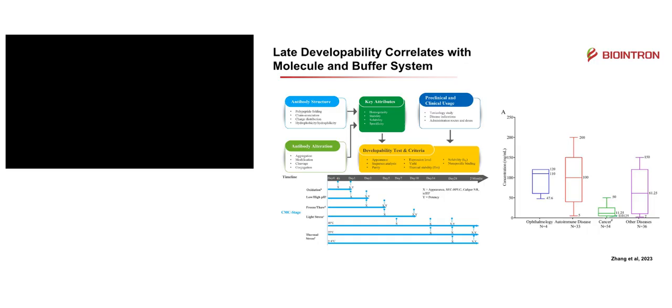For cancer, we have a slightly lower requirement on the concentration of the formulation. And so in that case, we have to do these experiments. So those experiments will tell you how the antibody fares when we stress them, when we apply stress on the antibodies. So that means you have a simulation of the antibody. So you do a 40-degree. That'll be a simulation of the conditions in vivo, or you do freeze thaw.